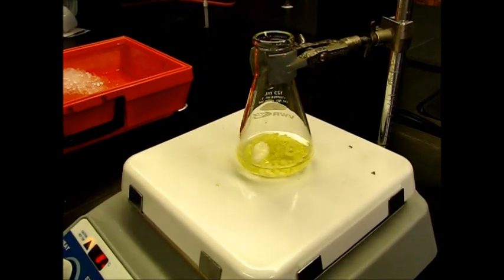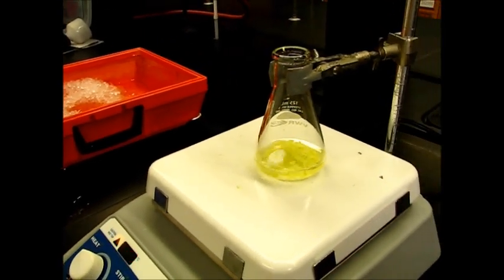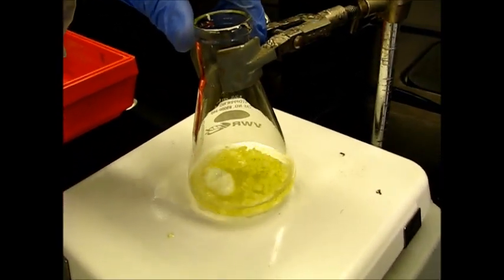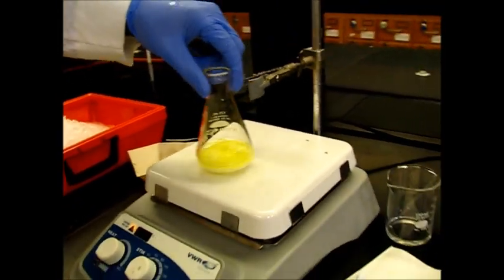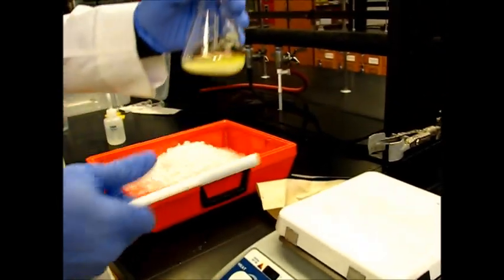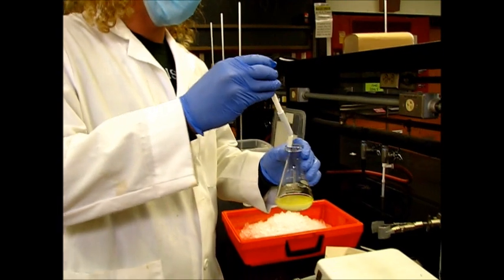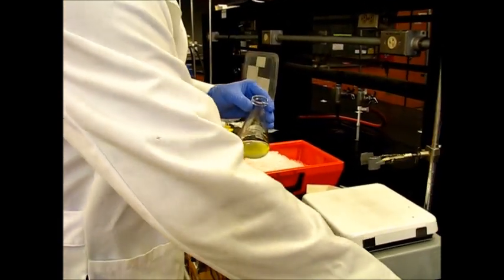Once everything is dissolved, we have to cool it in the ice bath for recrystallization. We dissolved the product in ethanol, let it stir and put some heat on it for a while, and everything is pretty dissolved. We're now taking out the stir bar — all the product that was stuck on it finally got dissolved, so it is safe to take that out without losing any product.